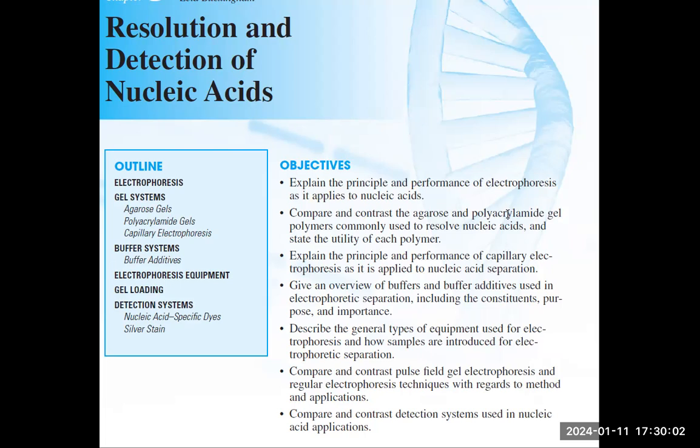And then what else? We also have the principle and performance of capillary electrophoresis. The widest application for that is for the separation of organic chemicals such as pharmaceuticals and carbohydrates. And then an overview of buffers and buffer additives.